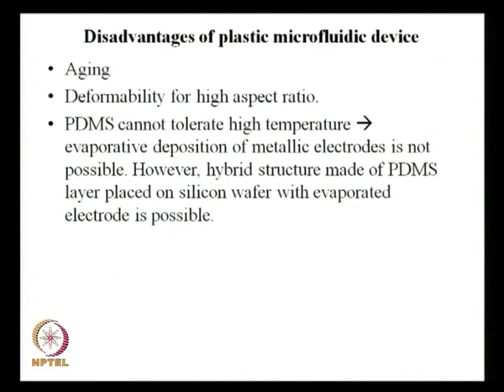Of course, nothing comes free. There are disadvantages of plastic devices. One major thing is aging. Plastic devices will not retain their properties for a long time, so they have a shelf life. You make a microstructure device and keep it on the shelf. Just like when we purchase a medicine, it says 3 years from manufacturing, a shelf life is given. Similarly, plastic devices will not be there for ages, not for years. So there is a shelf life, and that has to be tagged.